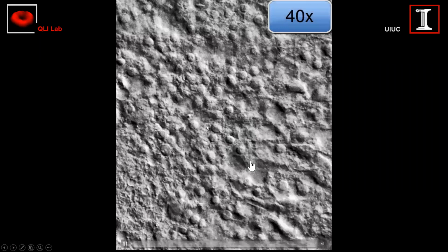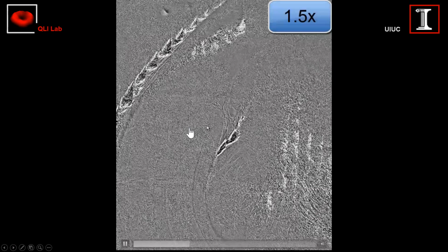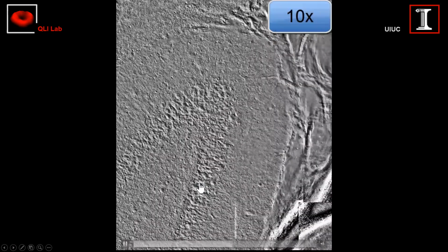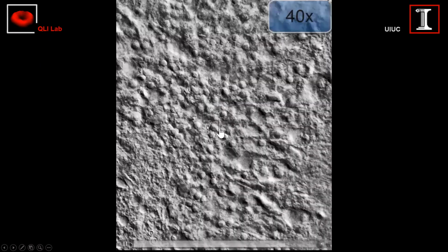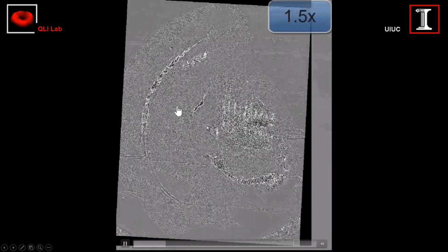This is completely different, meaning a lot more complicated, a lot more challenging to image, as you can see here. So it's a lot of background, a lot of scattering. This is again like a cloud problem. But you see with GLIM, we actually can remove that and we see individual neurons and sometimes subcellular structures.